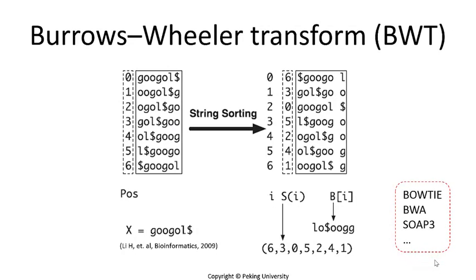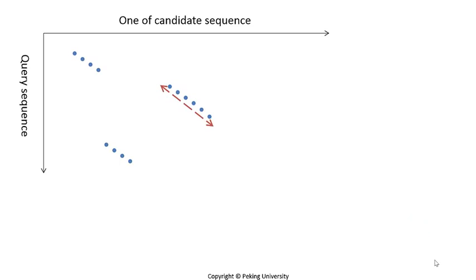For example, the commonly used Bowtie, BWA, SOAP3, and other tools have adopted the Burrows-Wheeler transform based on suffix trees. This transformation can extend the aligned sequence by 1 base each time. The efficiency of memory usage and speed of alignment are thus improved considerably.